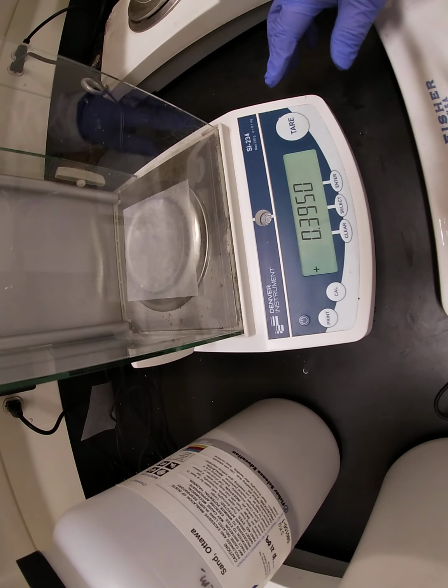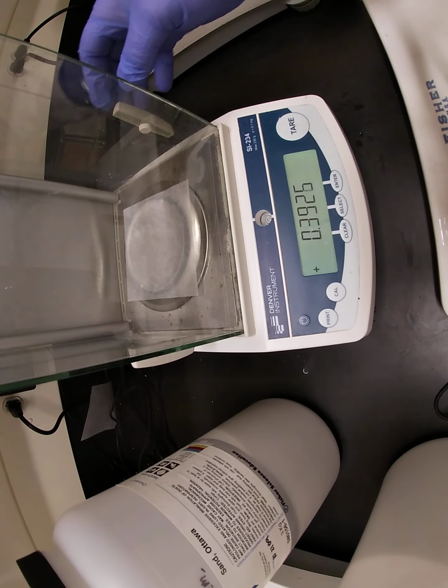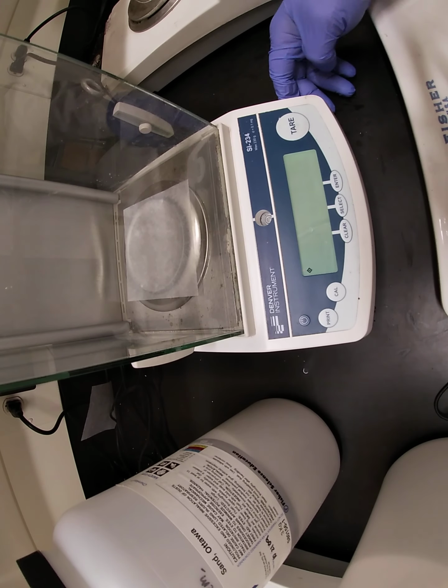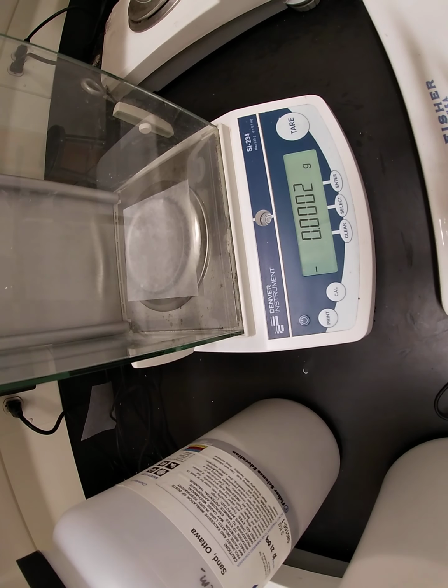I have just put a weigh paper on our analytical balance, and we're taring it. And our first chemical that we're going to do is called naphthalene, C10H8.